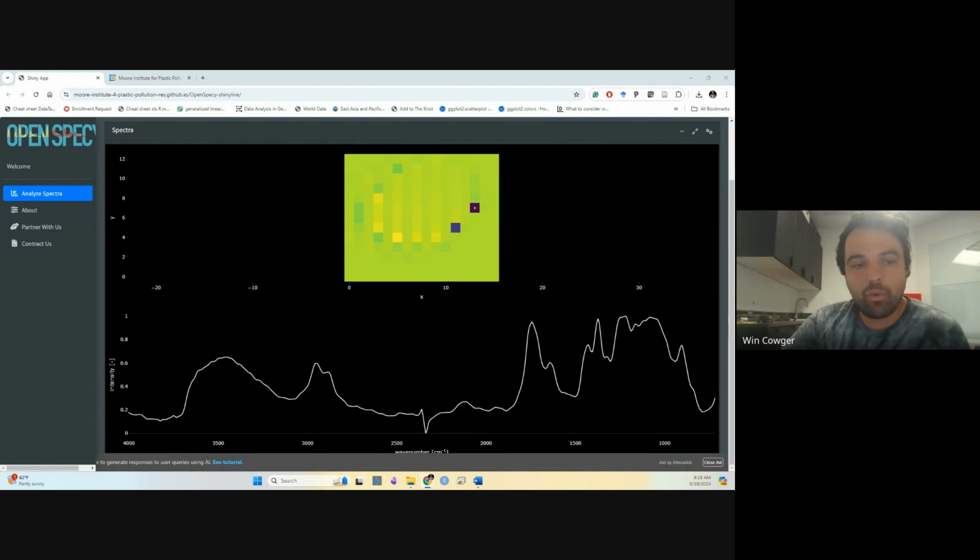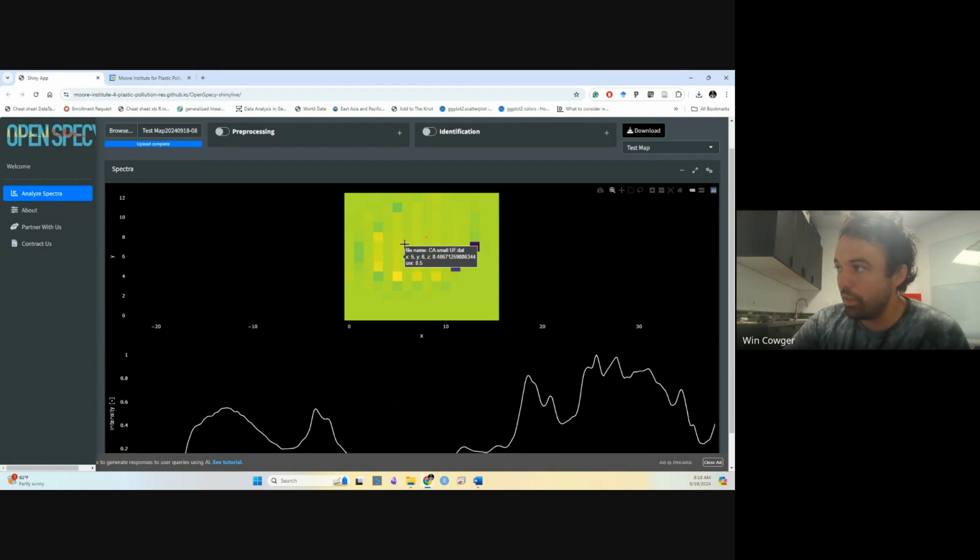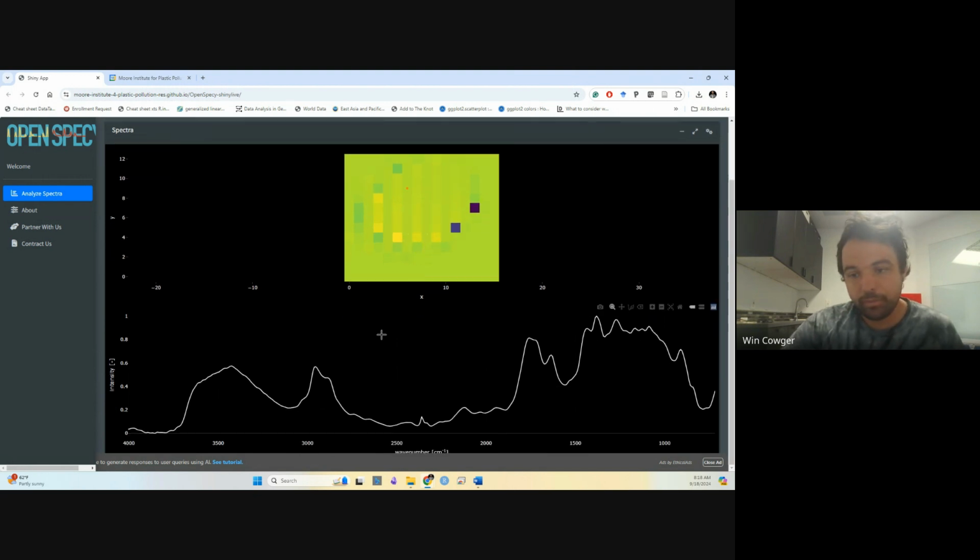Any questions about what a hyperspectral image is at this point? Is it clear to everybody what the properties of these hyperspectral images are? Or does anybody have any questions? Yeah, Julian, if you want to type the question or if you want to unmute, go for it.